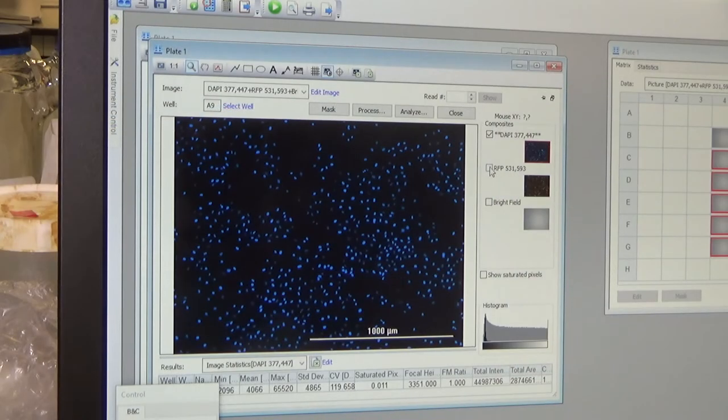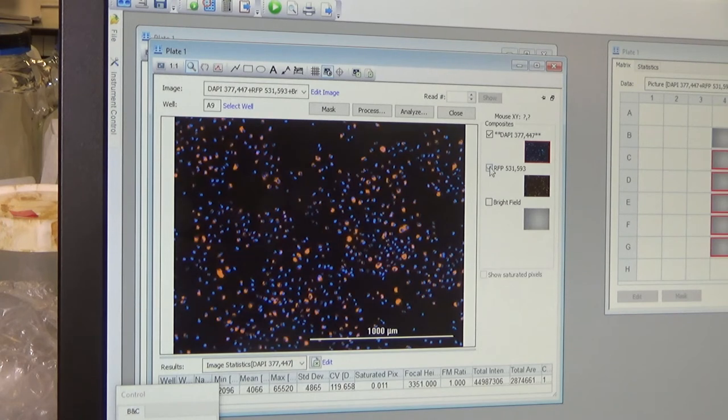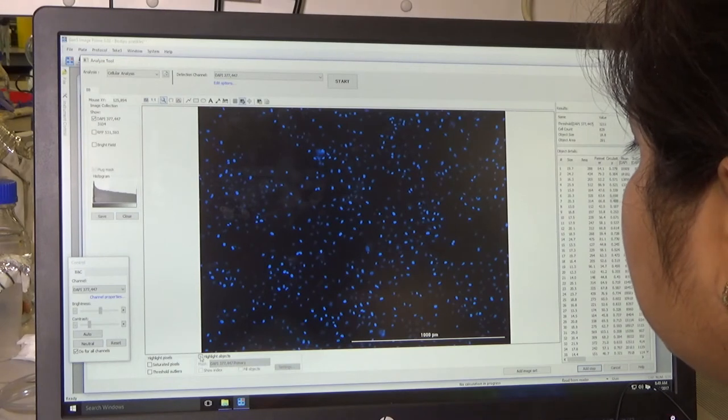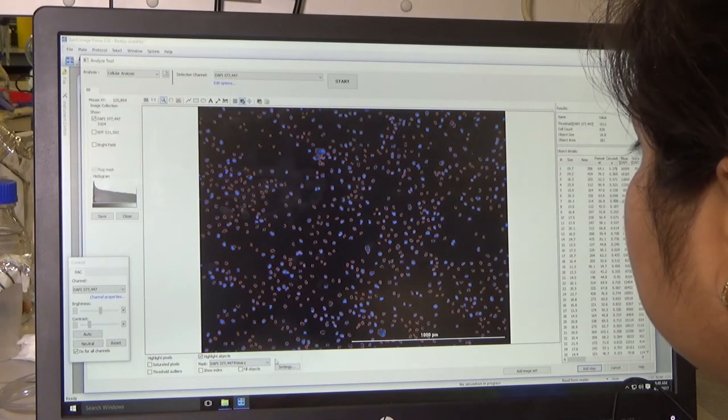In blue here we see the nucleus of the cells, and in red we have the nanoparticles. And the Gen5 software uses the nucleus dye to isolate individual cells.